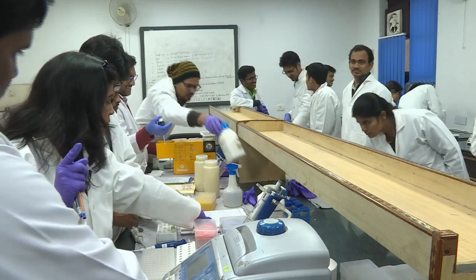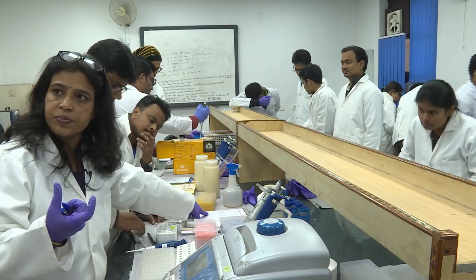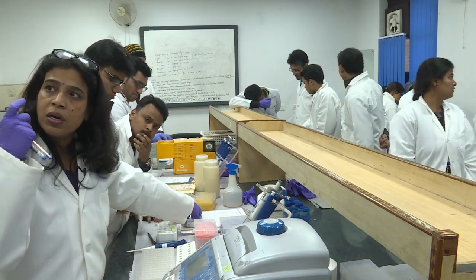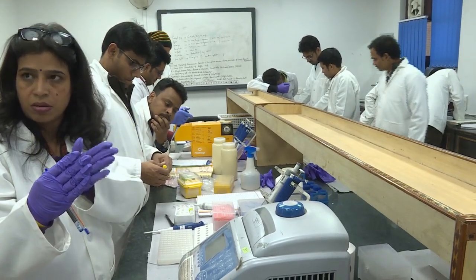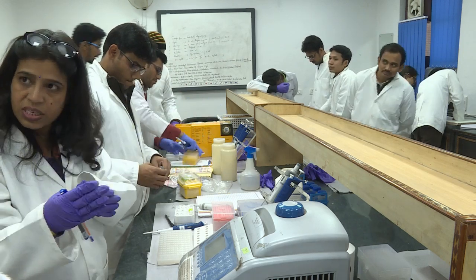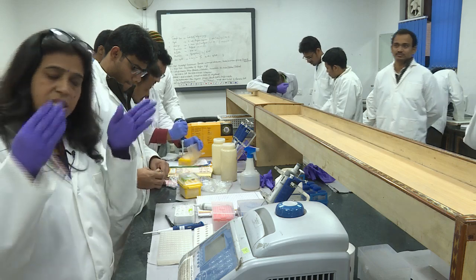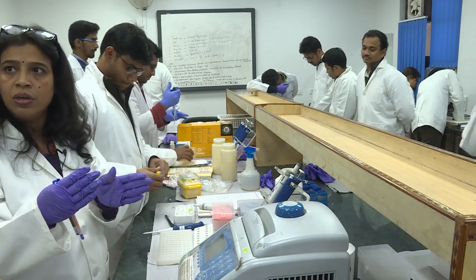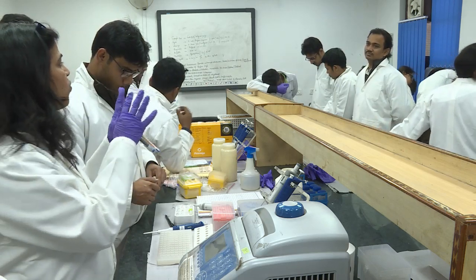According to the 50 microliter reaction, since my buffer is 5x concentrated and I am setting up a 50 microliter reaction, I have to use 1x, right? That's the reason I am using 5x buffer, to make it 1x in the 50 microliter reaction, right? These calculations you have to learn before setting up anything. Please, this calculation is for everybody.